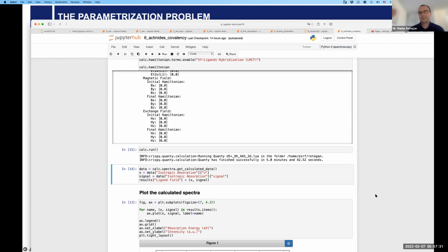If you do data analysis on one beamline only, which has tons of data, then for sure you're able to run these commands. But we are currently going to 3 different synchrotrons, and maybe a 4th one comes up now. And I don't know, the KID group goes to even more, I guess, than 4 synchrotrons. I prefer to have a common program like Athena or Larch, and they write converters for loading the data, rather than to have to learn something new at every synchrotron. Exactly.